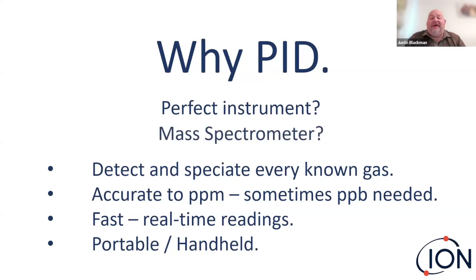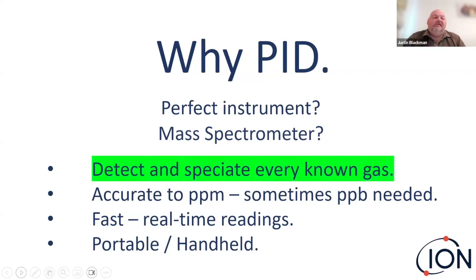So what is perfect? Is a mass spectrometer perfect? Well, I don't think so. I do think it's good. It can deal with detecting and speciating almost everything.